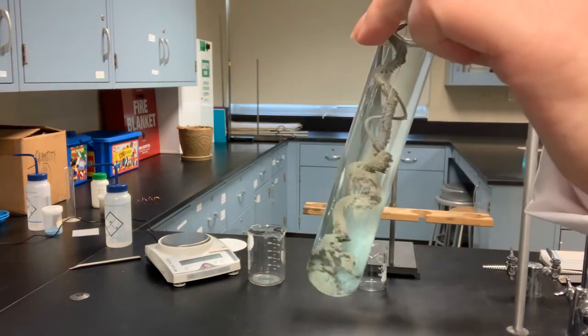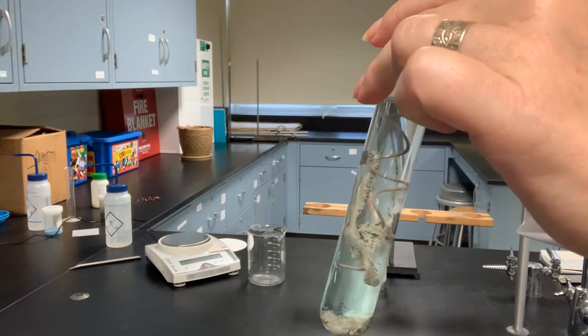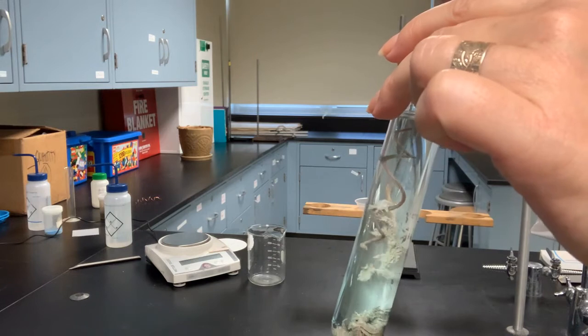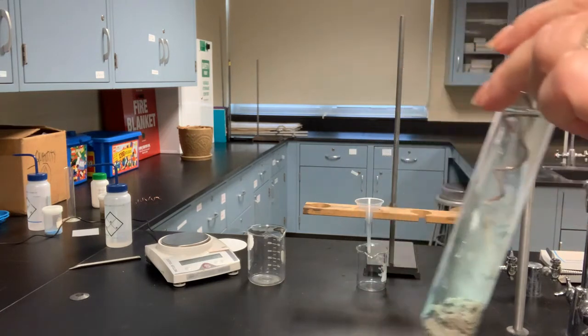So what I'm going to do here is just kind of slowly agitate the solution, but I want to be careful because metals in general are soft and malleable. So what I want is for these large silver crystals to actually fall off the wire as much as possible without getting them stuck to the sides of the tube. So that's what I've done there.